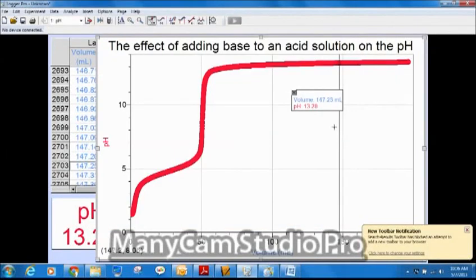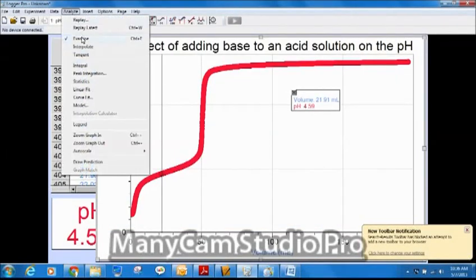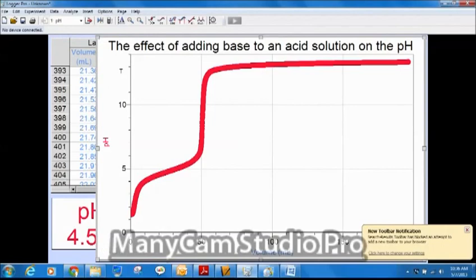All right, what I want to do now is to go over how to set up your graph for analysis and also how to copy it and paste it into a working document so you can submit your post lab. When you first get your graph in the lab, you're going to have something like this.